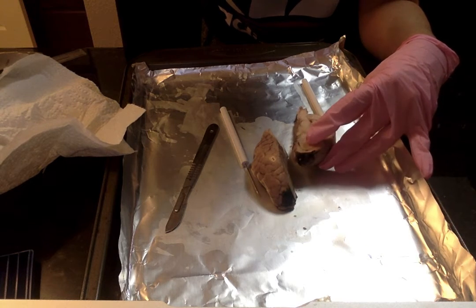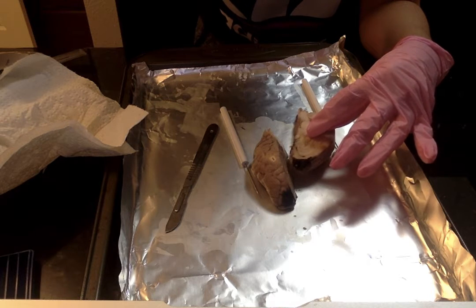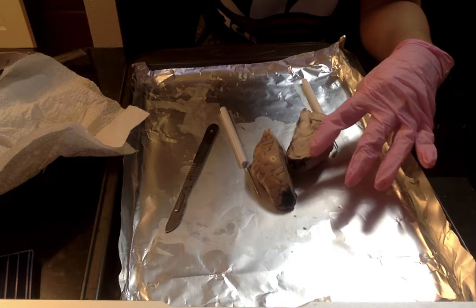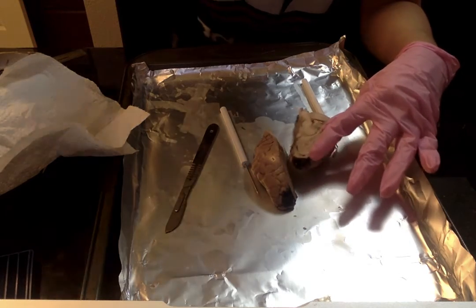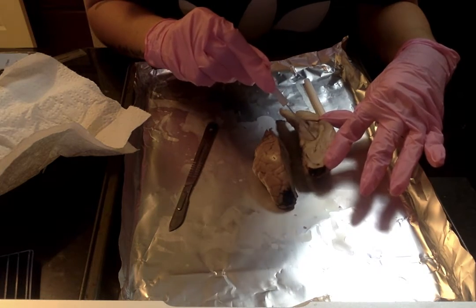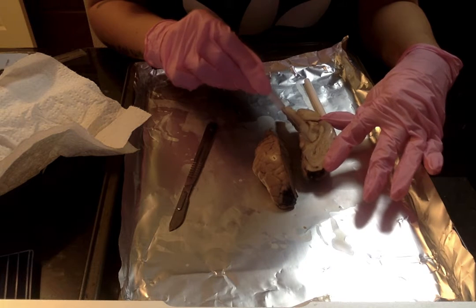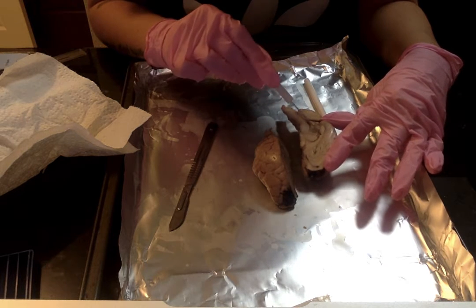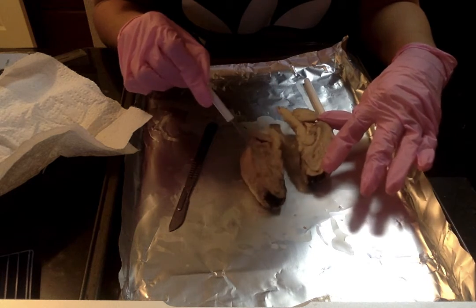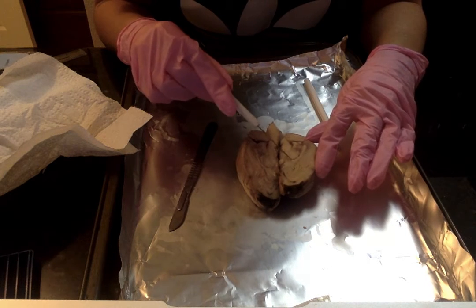It's interesting, all through here, it's got that strange feel to it. So yeah, that's the corpus callosum, and right in here, it's like a thick bundle of nerve fibers, and this is what connects the two hemispheres of the brain, which ensures that they can communicate with each other back and forth and send signals to each other.